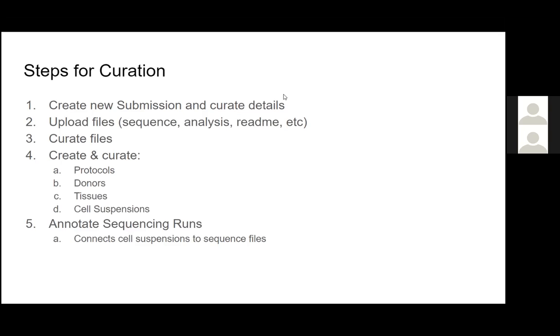After we create that submission, really one of the next things to do is to start uploading your files. So these are going to be your sequence files, your analysis files, readmes. For submissions that include lots of imaging data, currently we don't have the workflow set up for exactly how we're going to ingest those, whether they're going to come directly through the ingestion broker, or if they're going to go directly into our imaging server, which is Omero.